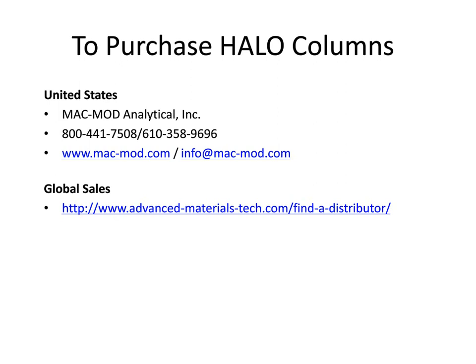All right. So we're actually redoing some of the experiments that we have completed with capillary columns with larger internal diameter columns, so we can get even better data from some of those closely eluting peaks, essentially by just really taking down as much post-column dispersion as possible. Don't know if that answers your question. Are there challenges? There absolutely always is when interfacing mass spec.